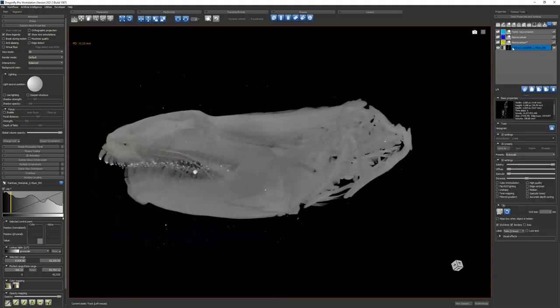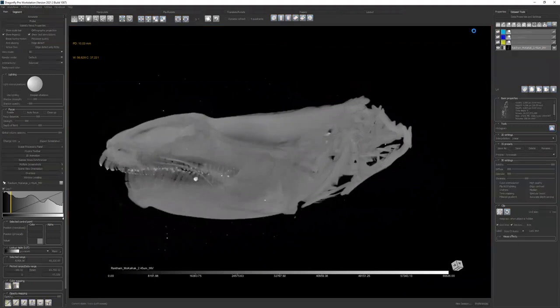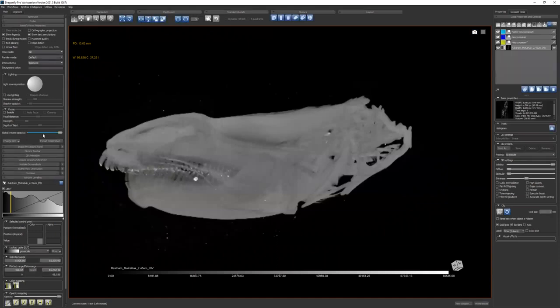So select your data. You're showing it in 3D. To take an image, you just have this little camera icon up here. Click that. Everything kind of goes dark. Then everything comes back. Export screenshot is over here.